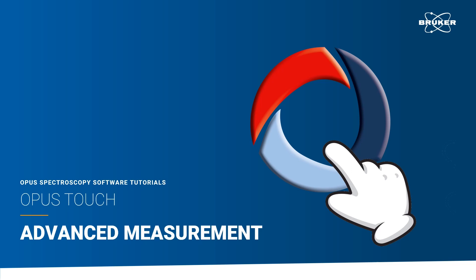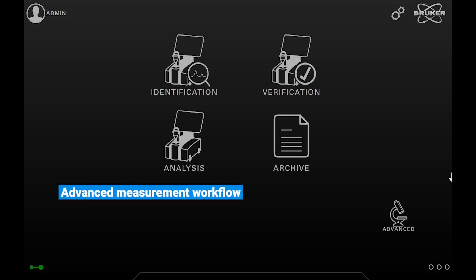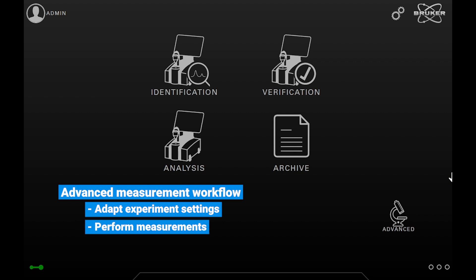In this video you will learn how to use the Advanced Measurement Dialog. The Advanced Measurement Dialog is a tool that can be used for the adaptation of measurement experiment settings, which are stored in files with the extension XPM. It can also be used to perform measurements and to align certain accessories, such as the drift module.